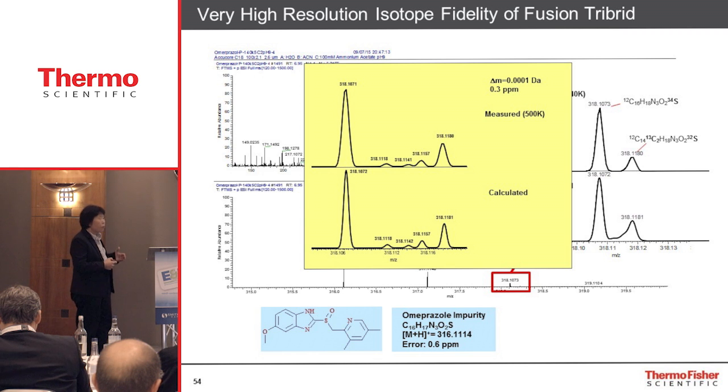So that's why we say a high-resolution mass spec gives you all those benefits. Horizontally, you know what kind of elements are present in your unknown, in and out. And then vertically, by their relative abundance, you can calculate how many, right? So that's why we say you can do element counting, right?